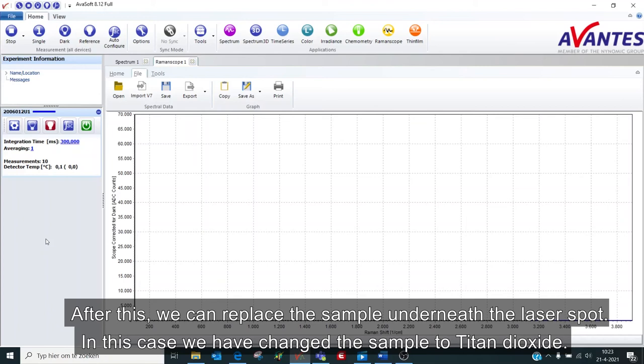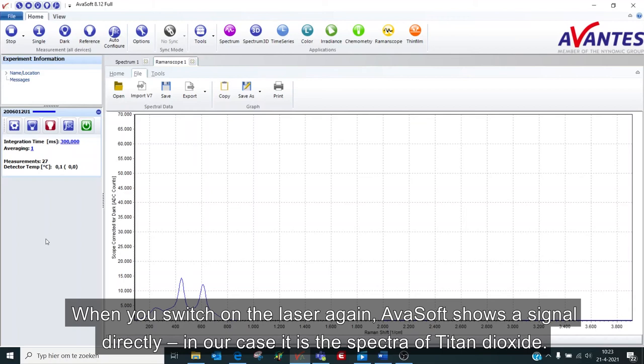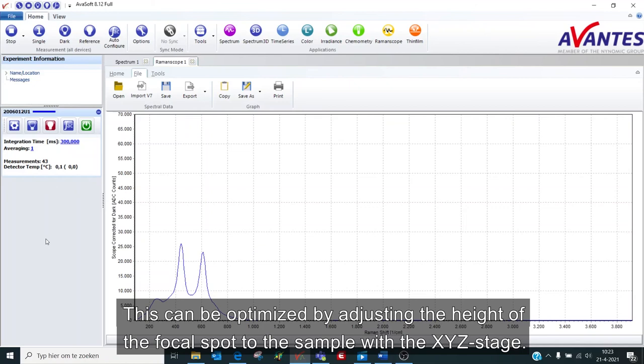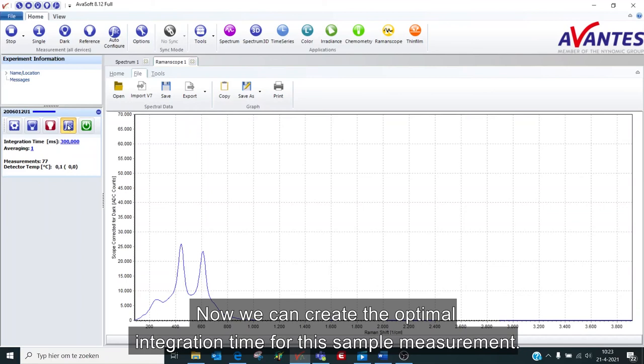When you switch on the laser again, AvaSoft shows a signal directly. In our case, it is the spectra of titanium dioxide. This can be optimized by adjusting the height of the focal spot to the sample with the XYZ stage. Now we can create the optimal integration time for this sample measurement.